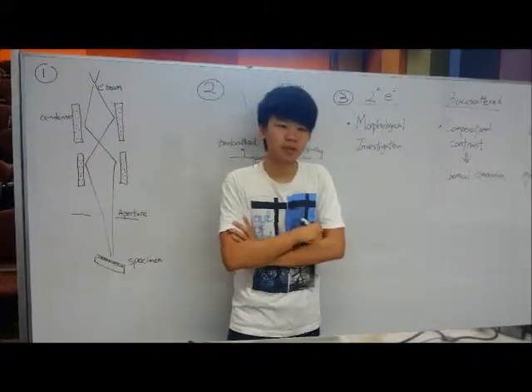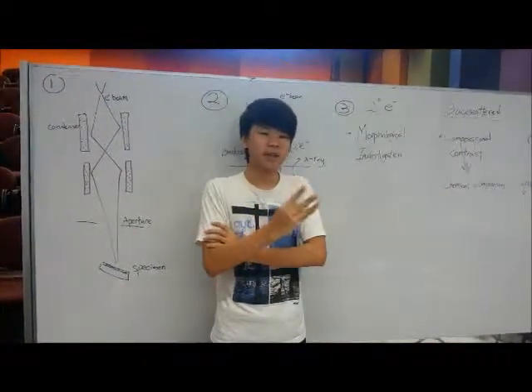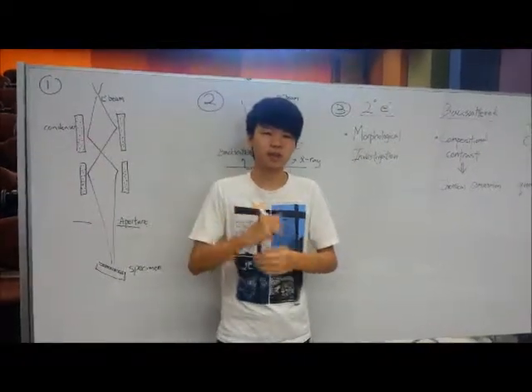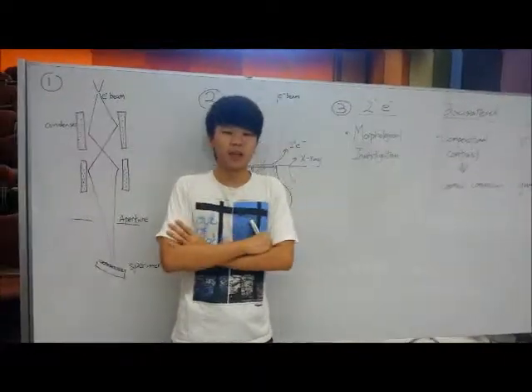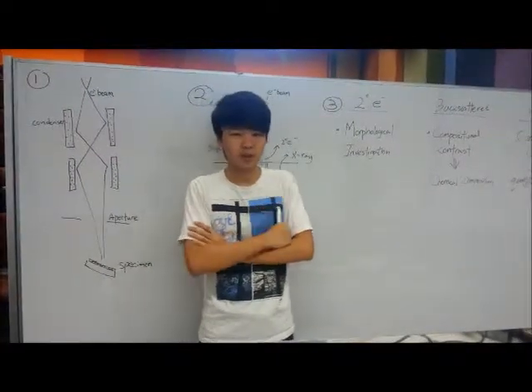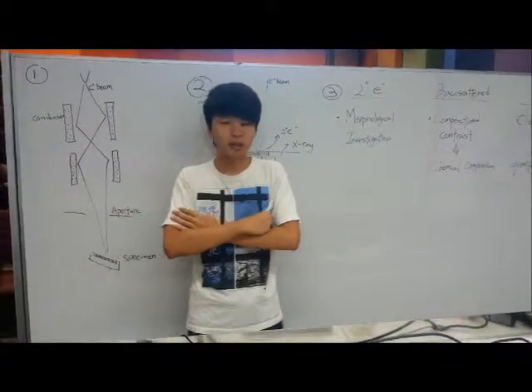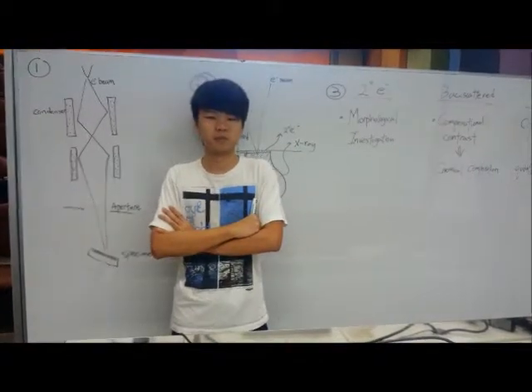I'll be talking about SEM. So what exactly is SEM? It's a type of electron microscope where a focused beam of electrons is used to scan a sample instead of a light ray, which is a light source. And many people will be asking what the advantages are. Well, one of them is higher magnification and resolution as compared to a light microscope.